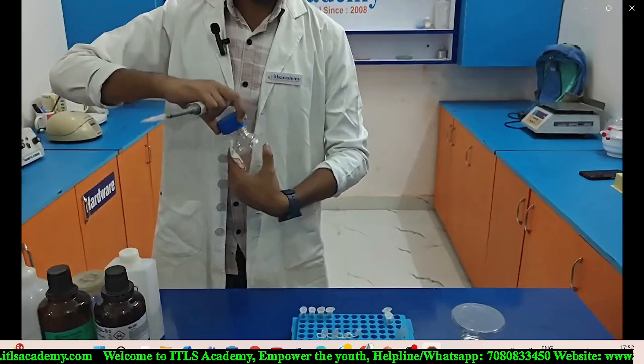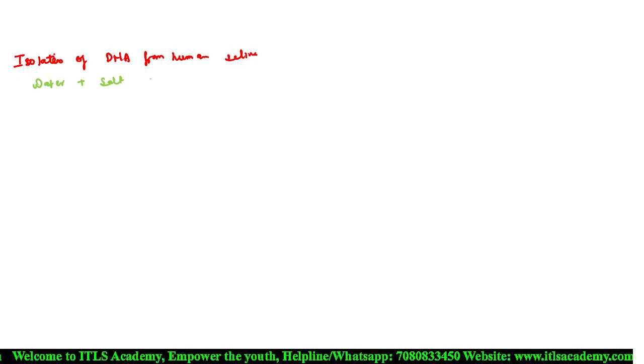Isolation of DNA from human saliva. For this, what we have to do, we take water and add salt into it. Okay.